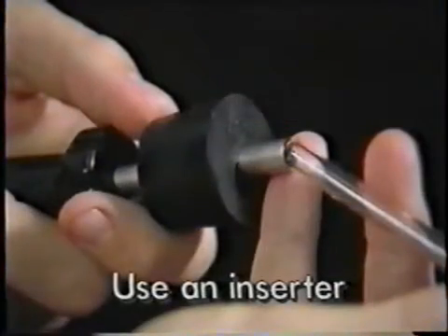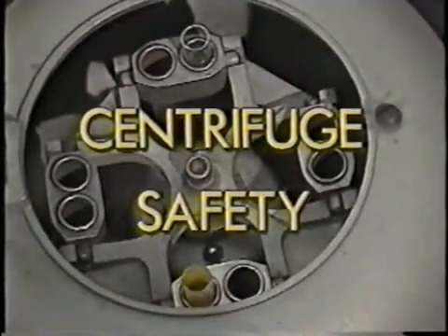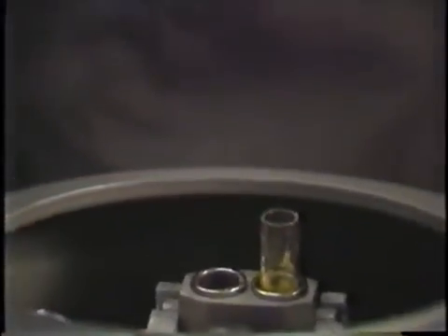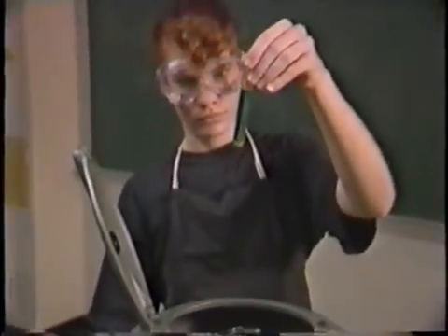Use an inserter to place glass tubing in a stopper or remove it, or lubricate the tubing and protect your hands with leather gloves. A centrifuge spins mixtures in test tubes to separate solids from liquids — the solids move out toward the bottom of the tubes and the liquid stays on top.